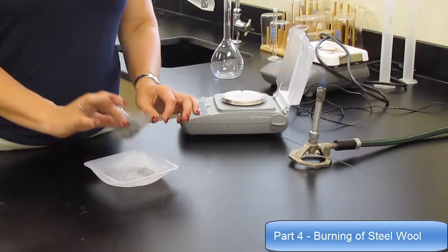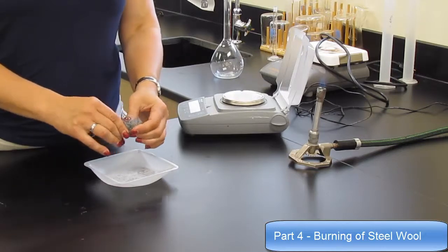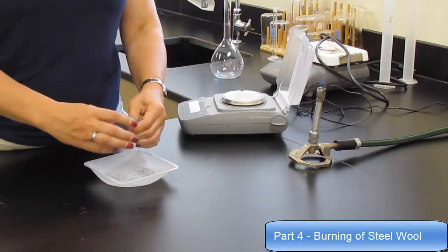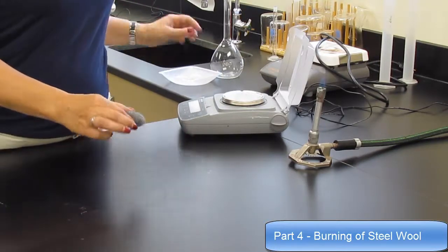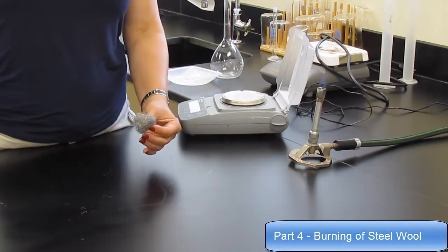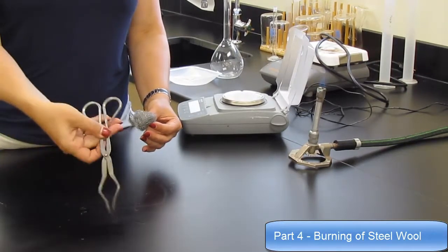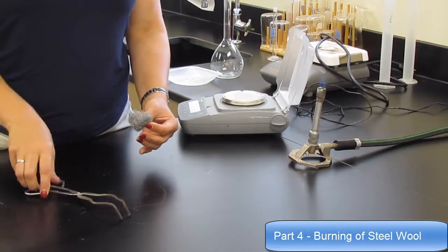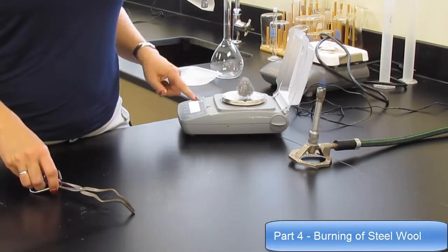Part 4, mass of burning steel wool. For this one, you're going to need a Bunsen burner that is lit. You're going to need your steel wool from before. You can now ball your steel wool up for use in this one. Take the mass of your steel wool after you've balled it up. You're also going to need tongs, because obviously we don't want to hold the steel wool in the flame with our fingers.